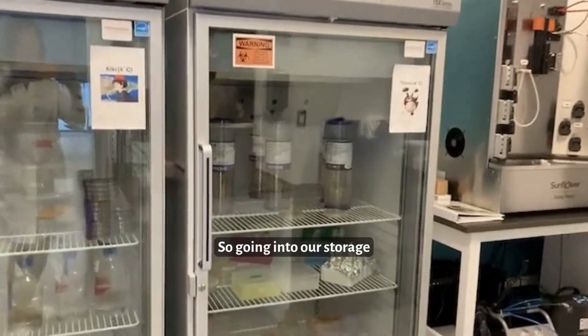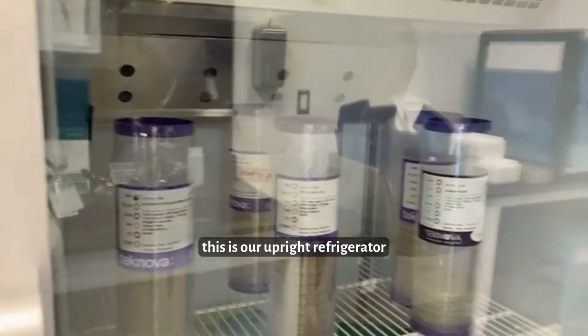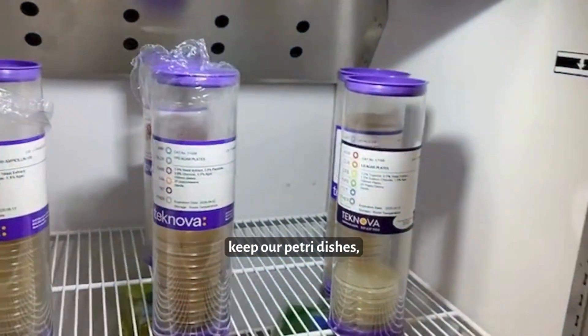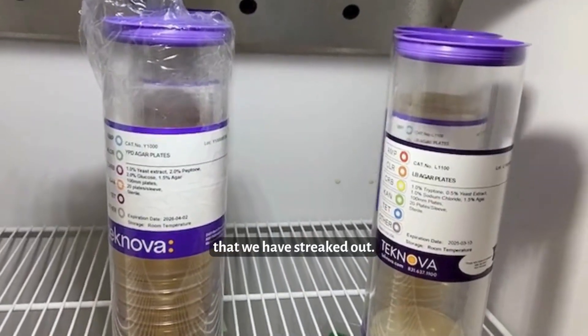Going into our storage area for our lab, this is our upright refrigerator where we keep our petri dishes — both the sterile ones and the ones that we have streaked out.